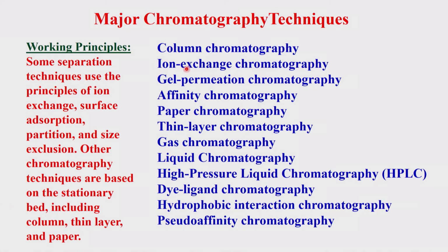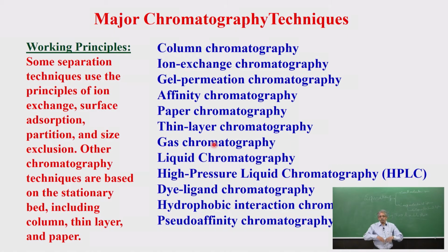Okay, thin layer chromatography: like paper chromatography, you can also make the stationary phase into a thin layer, which is most commonly known as TLC. It is the first thing one does in organic synthesis: putting a spot on the TLC and looking at whether your reaction is complete or not, by looking at whether your starting material is completely consumed or not. Based on that, okay. I'll be explaining the principle, how it moves, what it means. Everything is coming up in the future slides.